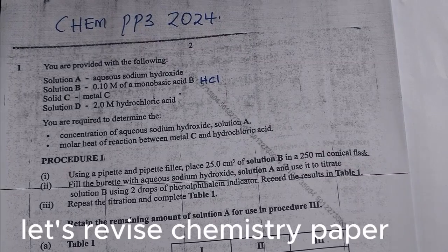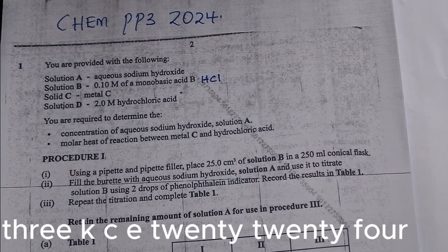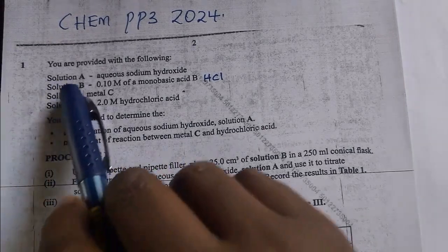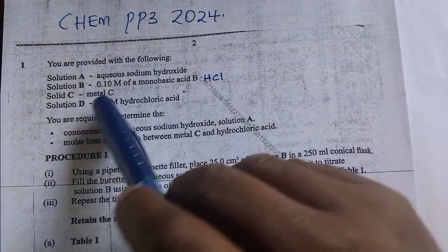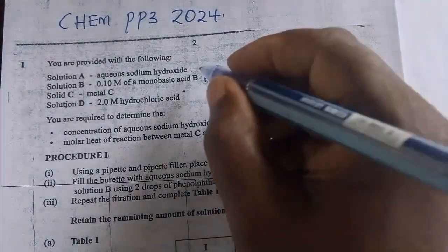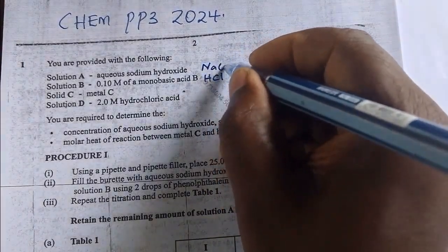Welcome. Let's revise Chemistry Paper 3, KCSE 2024. You are provided with solution A, aqueous sodium hydroxide. So this is sodium hydroxide.